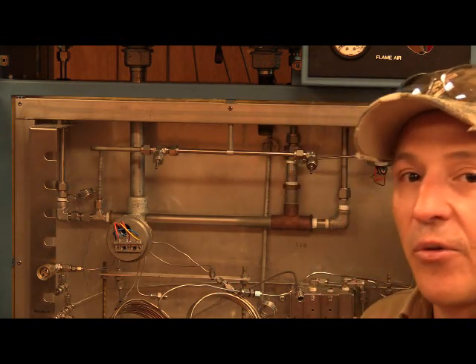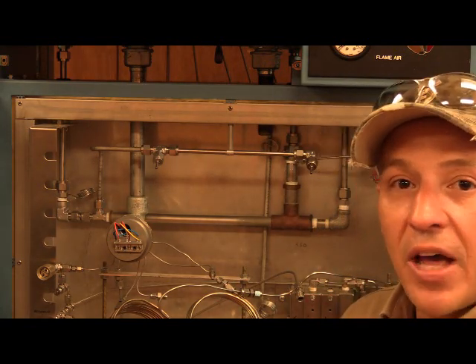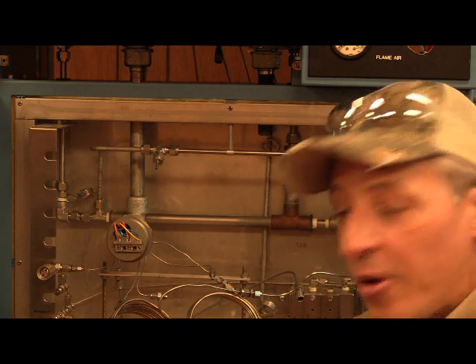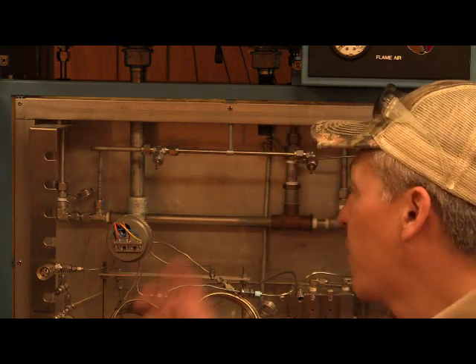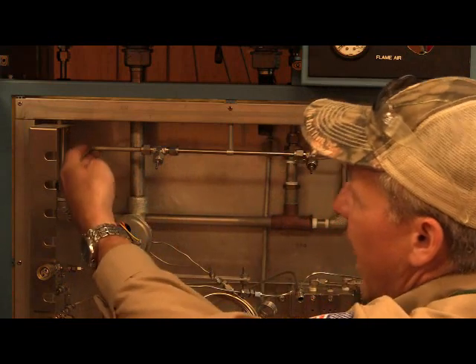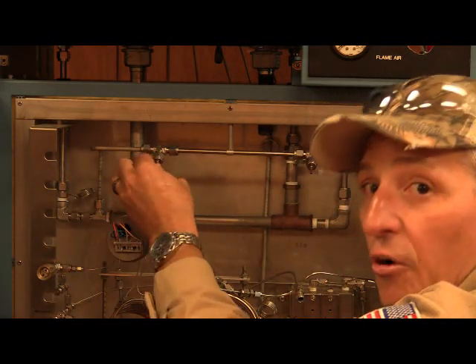Let's just say it this way. When you go to your grandma's house and they have that little space heater in the bathroom where you turn it up to 10 and it looks like the inside of a toaster oven and it gets orange, super red hot, that's what's going on inside of here whenever it's really cranking the voltage up and hammering it with amperage and it gets super glowing red, and then you put air coming in across it, then the air comes up and goes out and blows.